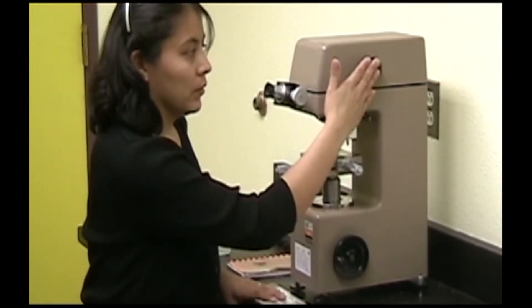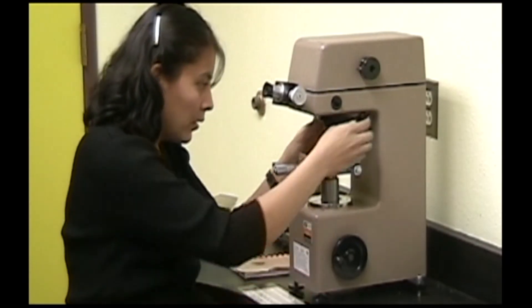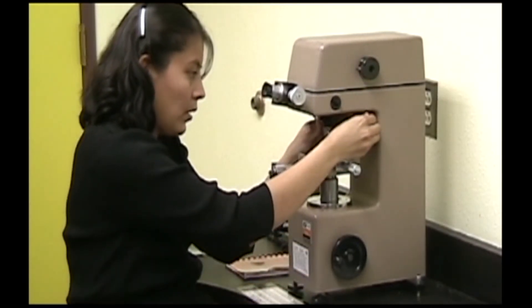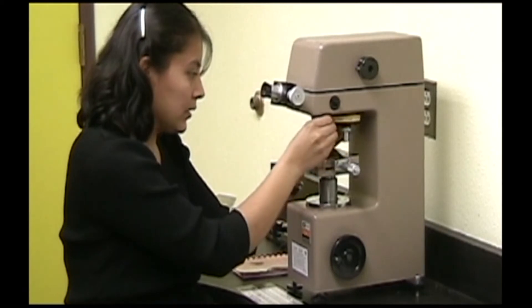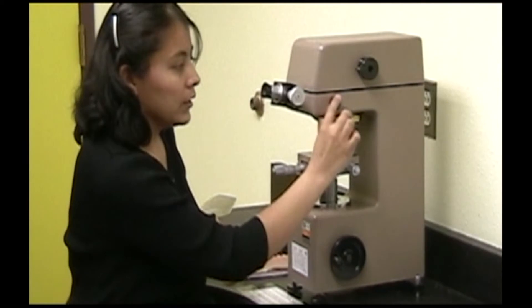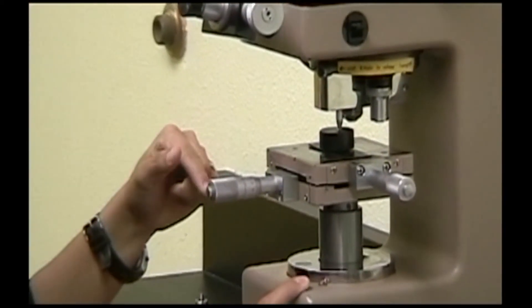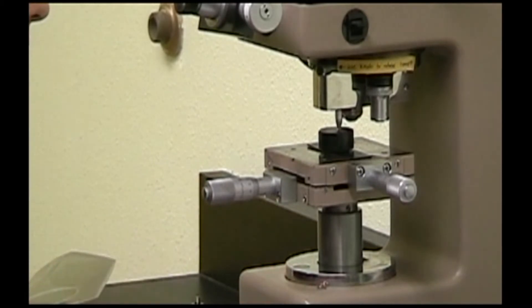Once you're confident that you've set the right test load and dwell time and chosen the spot you want to test, carefully switch to the indenter using this lever and press this button. A light will turn on and you can hear the indenter coming down. At this point, do not touch the machine and do not move your sample.